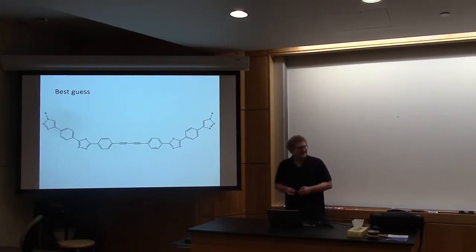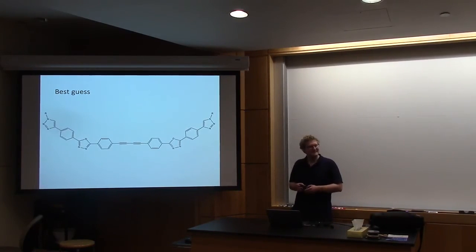Well, and again, the Glaser coupling is copper and oxygen. So keeping the system oxygen free should mitigate that. Although, from all of the literature that I could find, it never indicated that the click reaction should be kept oxygen free. I mean, it's used in biological systems all the time, so.